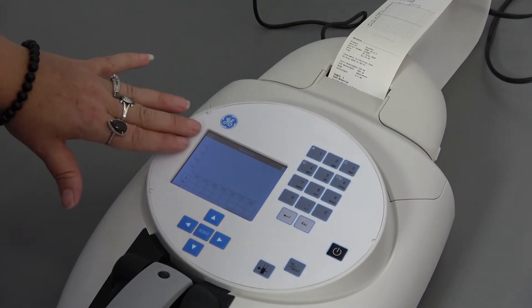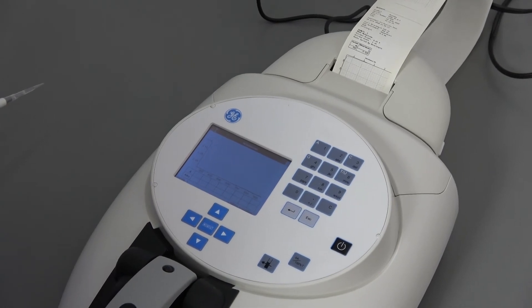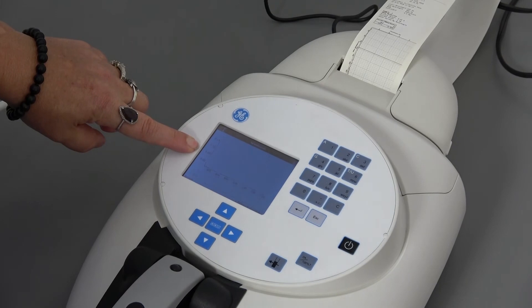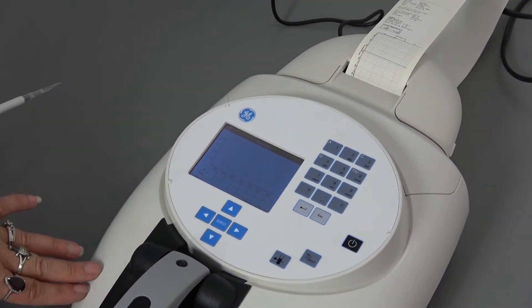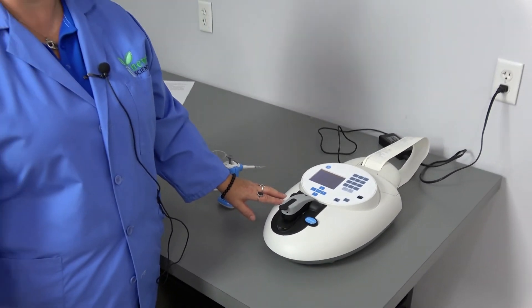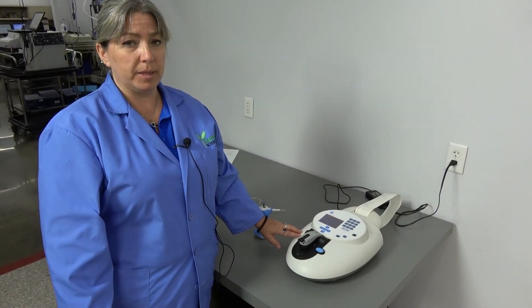We've already looked up what the result on distilled water should look like, and of course that is what we are getting. This particular unit has a display on the front of the monitor as well as prints out a results tape. You do not have to sync this with a PC; however, you are able to get software to make it sync with your PC for printing and other analysis applications.